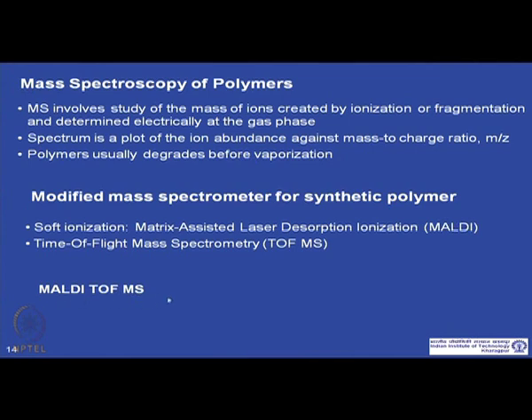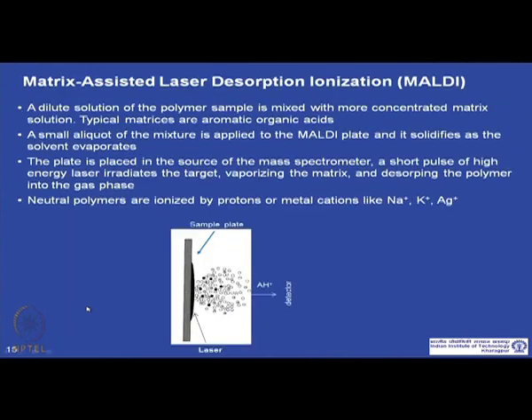So, we will discuss a little bit of MALDI TOF now. Let us discuss MALDI, matrix assisted laser desorption ionization. In this case, a dilute solution of polymer sample is mixed with a concentrated matrix solution, and the matrix is typically an organic acid.